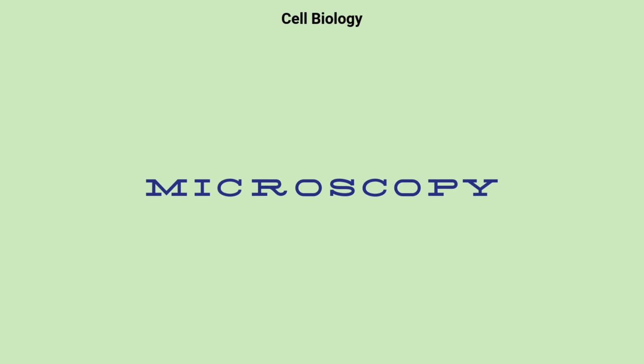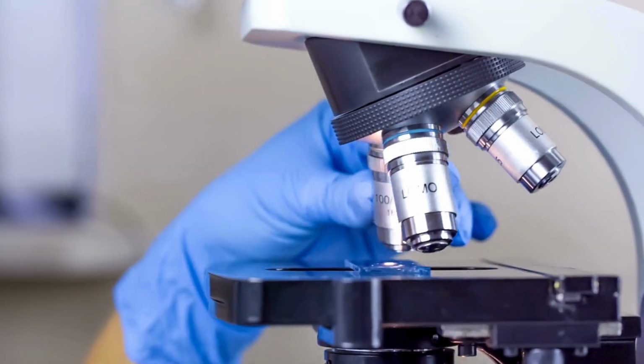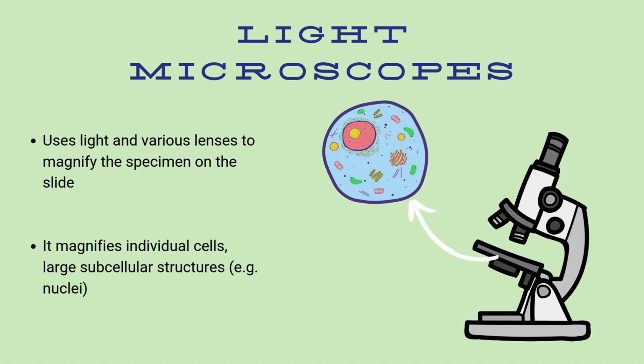This video introduces you to the concept of microscopy. Microscopes allow us to see things we cannot with the naked eye. Light microscopes use light and various lenses to magnify the specimen on the slide.